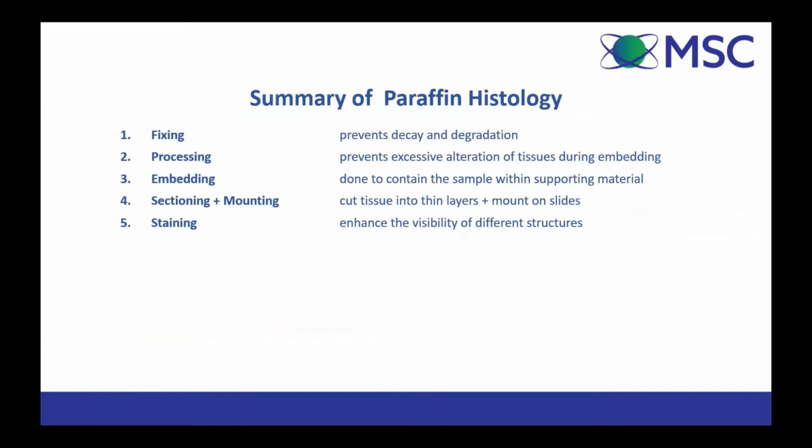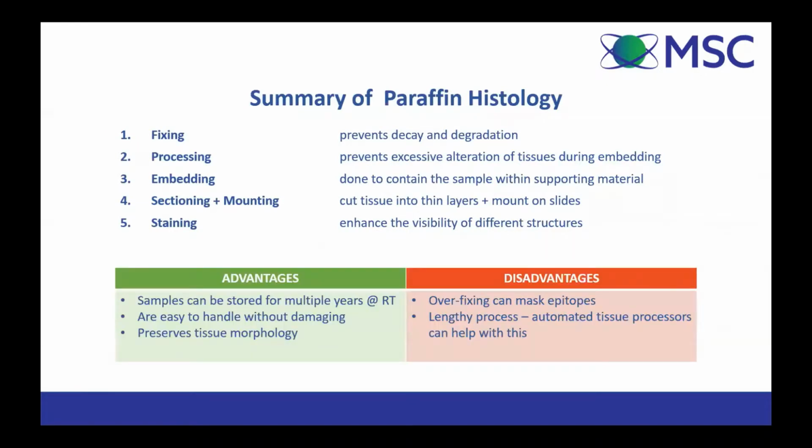So that is pretty much the process of paraffin histology. And of course, like everything in science, there are advantages and disadvantages to this technique. The advantages for paraffin histology are that your samples can be stored for multiple years at room temperature and are easy to handle without damaging. This is a great technique if you want to preserve and have a look at your tissue morphology. The disadvantages of this technique are that overfixing can mask epitopes.